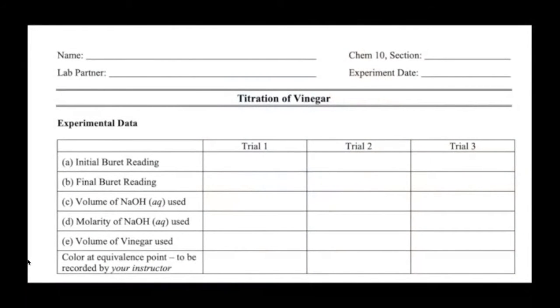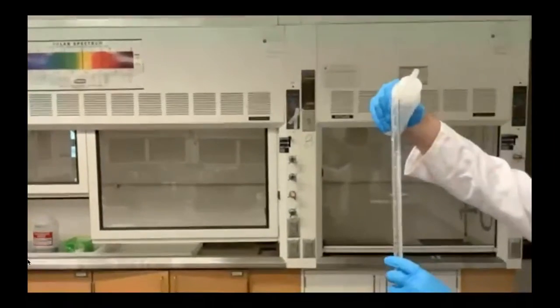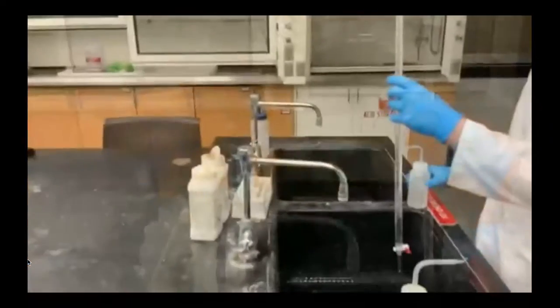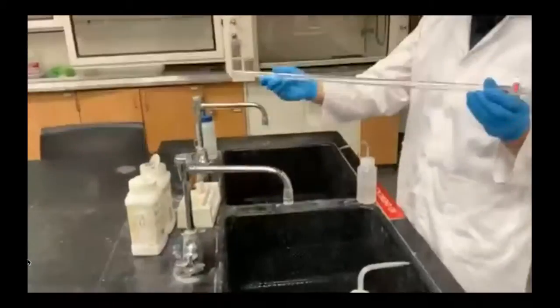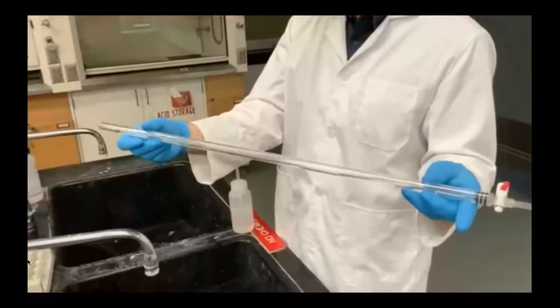On your lab sheet there is an experimental data table where you will record your data. First, we want to rinse the burette with deionized water. Swirl that around, give it a quick clean, and empty some into the sink.